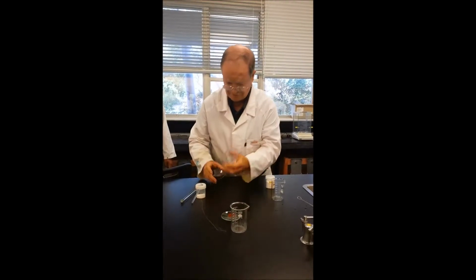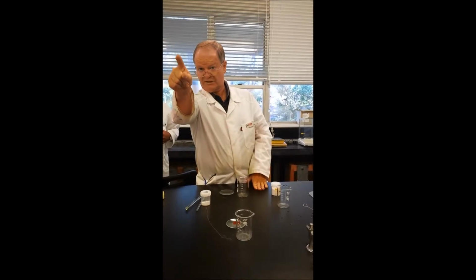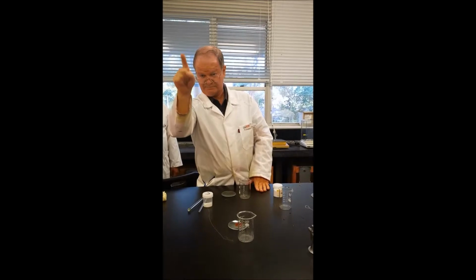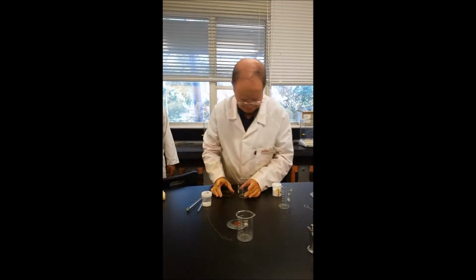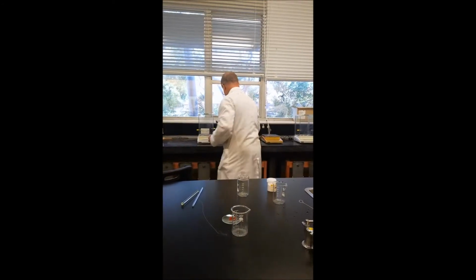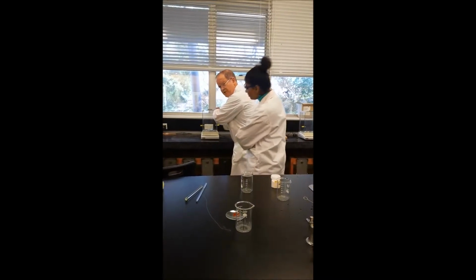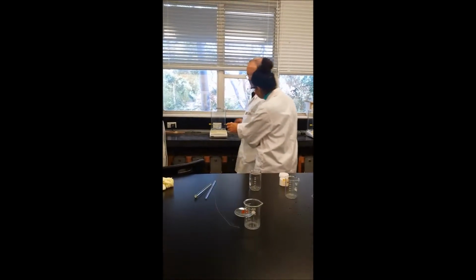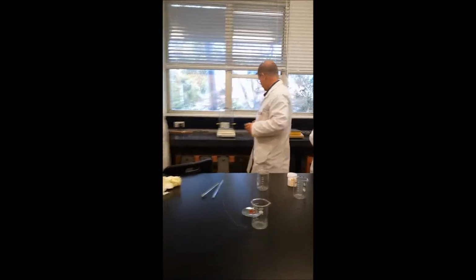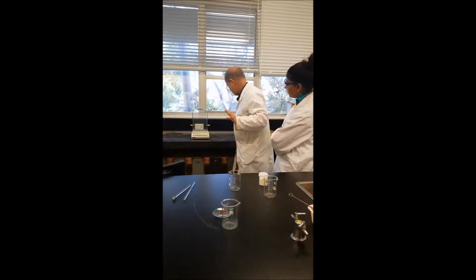Now I'm going to do the phenolphthalein first. In that fume cupboard over there, there is a bottle of absolute alcohol and a measuring cylinder. Could somebody go and get it for me, please? Okay, now the next one is going to be phenolphthalein, and we're going to weigh up. Yes, that's it. Bring it, please. Now, put the lid back on. Always put the lid back on. Right, now we've avoided cross-contamination. We haven't contaminated anything.